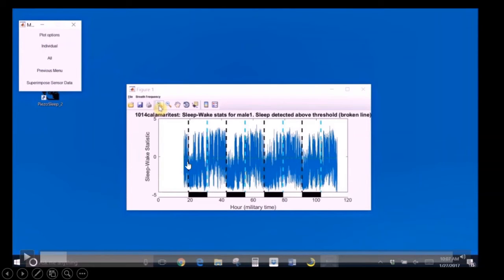That first couple hours can actually be interesting to analyze in its own right, because mice respond to that novel environment differently, but a lot of people just throw that out if they want a baseline sleep, maybe starting on the second dark onset and analyze these 3 days, or maybe at this light onset and look at these 3 days to average. Or you can run it for a week, 2 weeks, whatever you want.